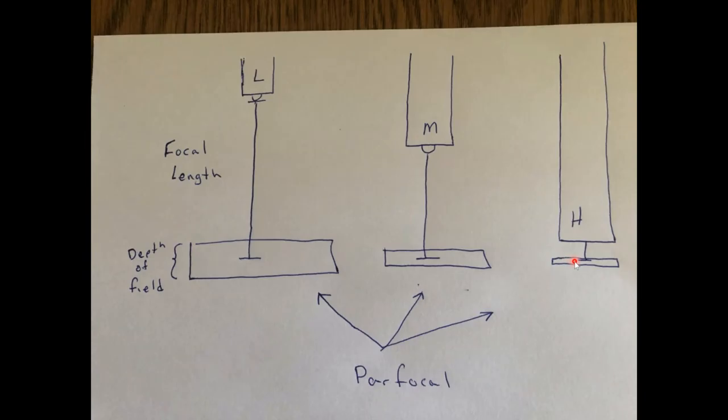Now, when you get to this lens, you need to take great care with the fine focus knob. If you turn it just a tiny little bit, not even a tenth of a way around, it makes a big, huge difference. If you just grab that fine focus knob and turn it half of a distance, you're going to be way out here. You won't see anything, and you might be able to go backwards and then find it again, but you might not. What happens if that occurs? Well, you just go back to medium power, and if you messed it up so bad, you just go back to low power and work your progression through. It's not too difficult. It's a skill that we want to have.